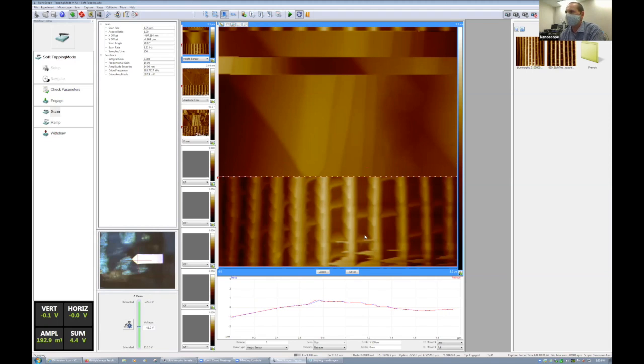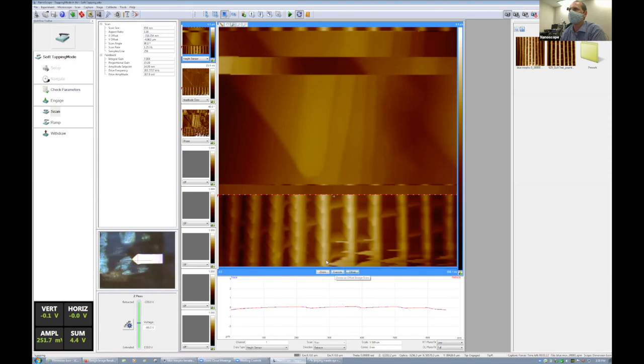All right, so we got a little closer. Let's get a little closer still and see this little staircase, what this might be. Sometimes the way I envision the feeling of the atom, it's kind of like, if you close your eyes and someone entered the room, you would kind of sense their presence almost. I don't know. I like using that analogy. I don't know, too wild, but yeah.